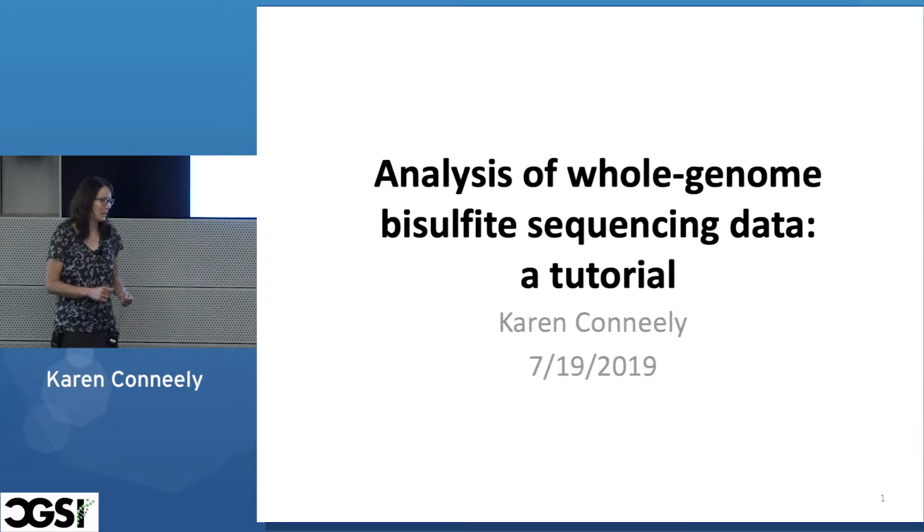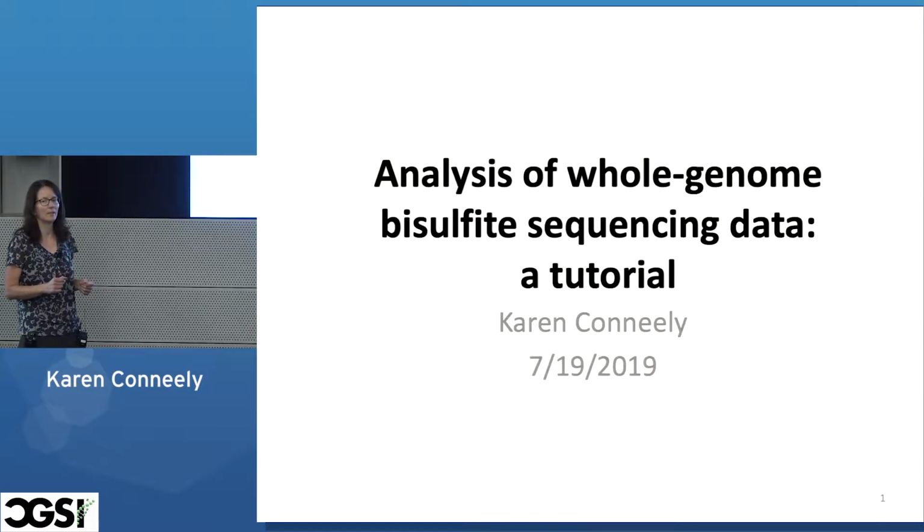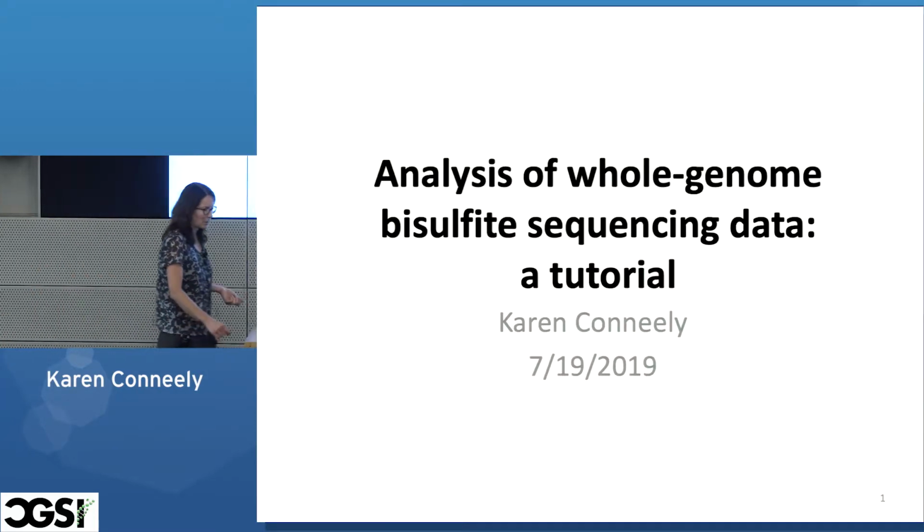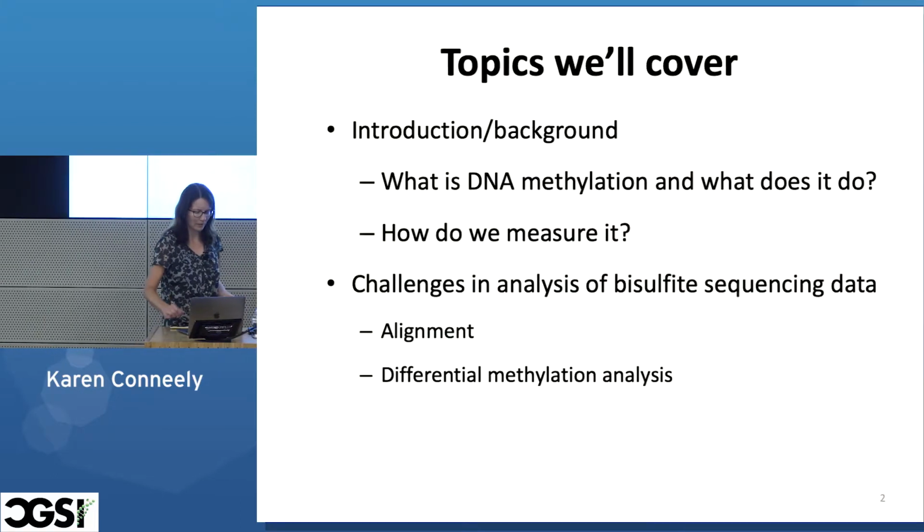Today I'm going to be talking to you about the analysis of whole genome bisulfite sequencing data. This has been billed as a research talk, which I think it is because part of the research I'm going to talk about is the stuff I was involved in, but not all of it. And so I think it is also a tutorial, because my goal is to give you a broad overview of the field.